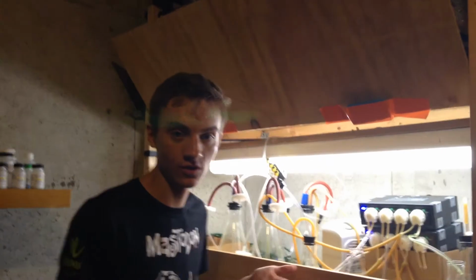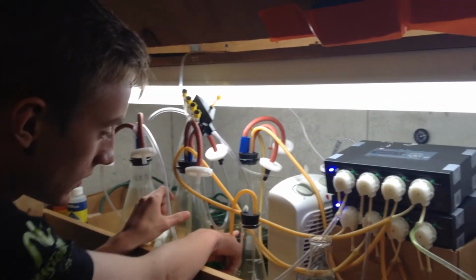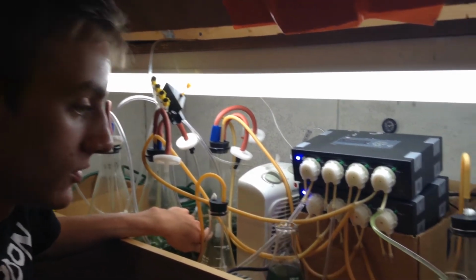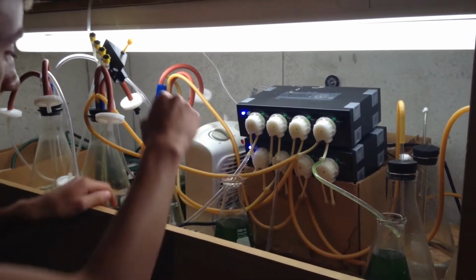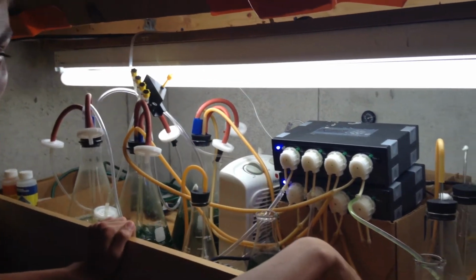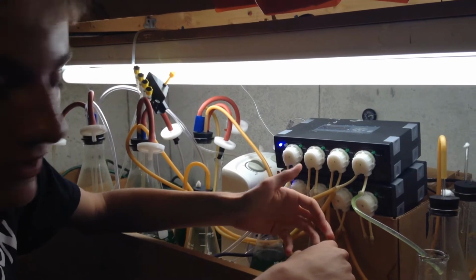I've run batch cultures initially, but now I'm running continuous cultures. You see here the cultures are kept at a constant volume and they're being diluted by nutrient medium taken from these flasks at some constant rate, and then at the same rate well mixed medium in this flask is taken out so that the culture remains at a constant volume and is being diluted at some rate.